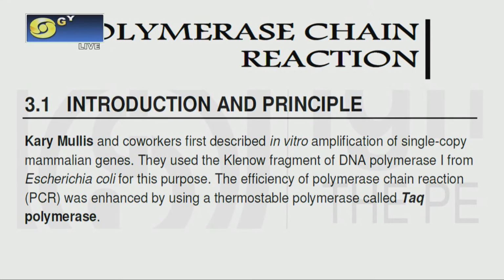That is, you want to know whether one particular gene is present in the genome. Okay. So for that, what you have to do? You have to do this PCR experiment. Take any gene, actin gene, for example. Actin is a cytoskeletal protein. And the actin gene is a constitutive gene, that is, it is present in all the systems. Now, if you want to know whether actin gene is present in the genome, what will you do? You have to do this PCR experiment.